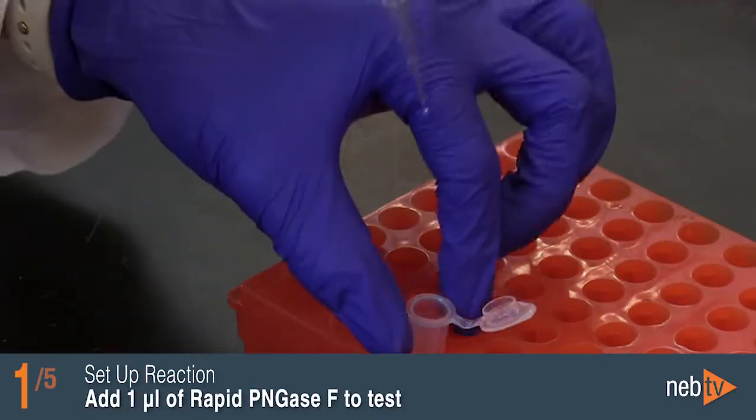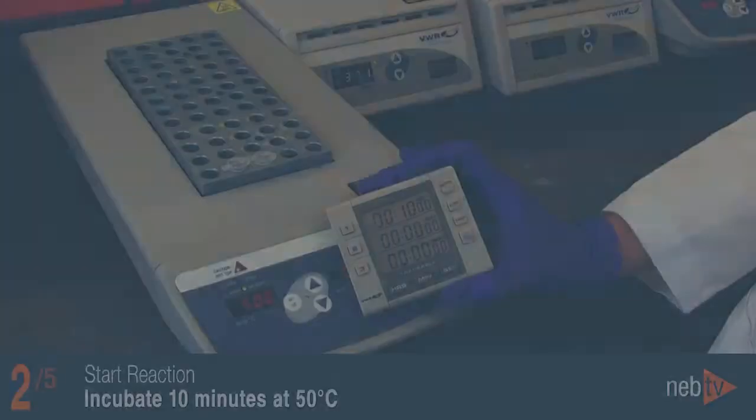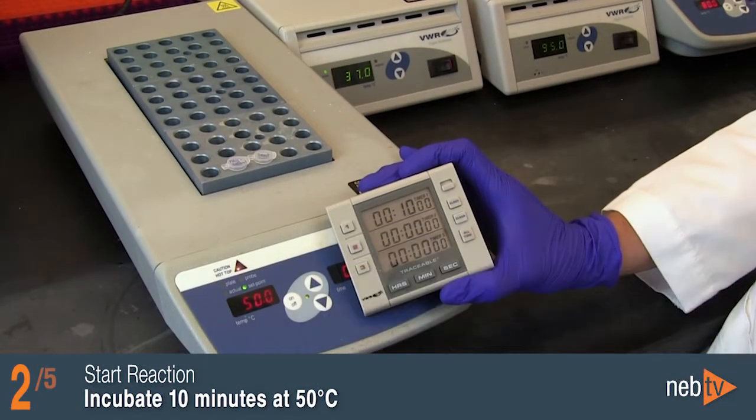Add 1 microliter of Rapid PNGase F to the tube labeled test and mix gently. Incubate both tubes for 10 minutes at 50 degrees Celsius.